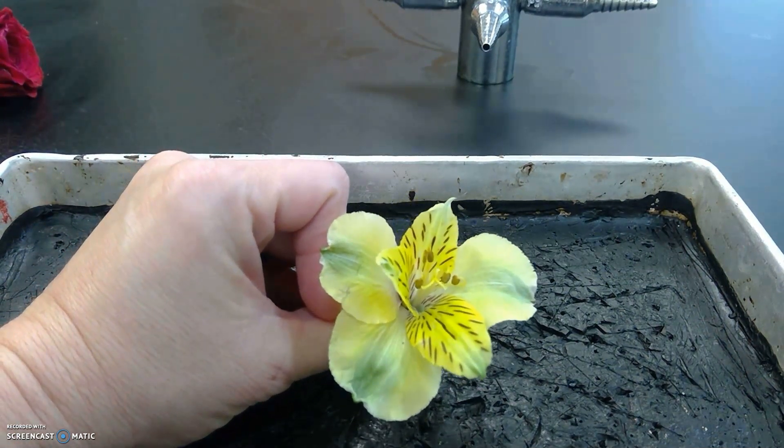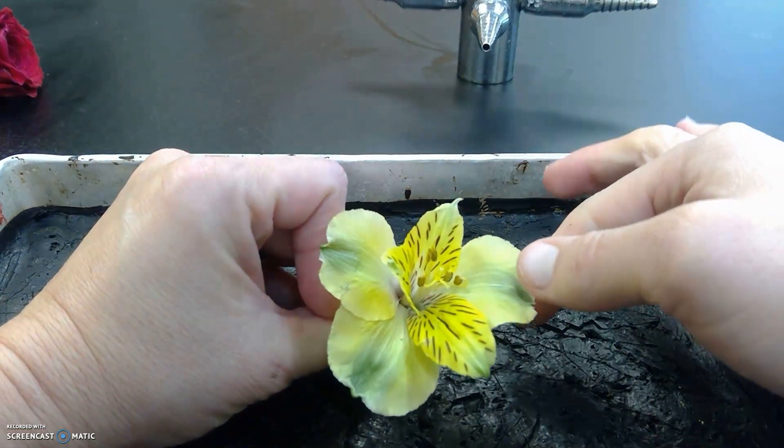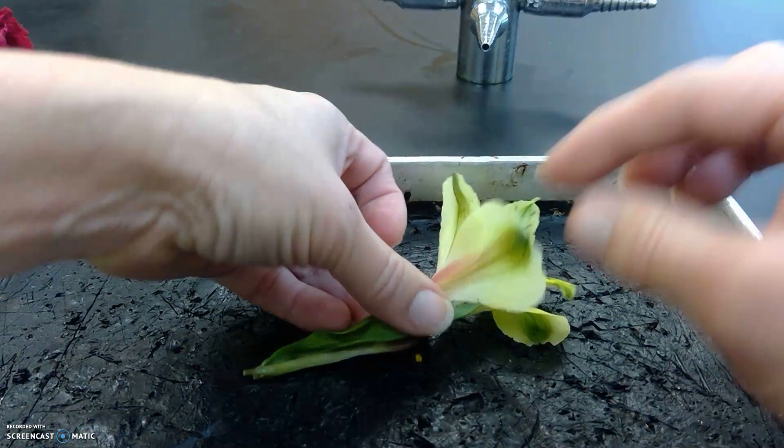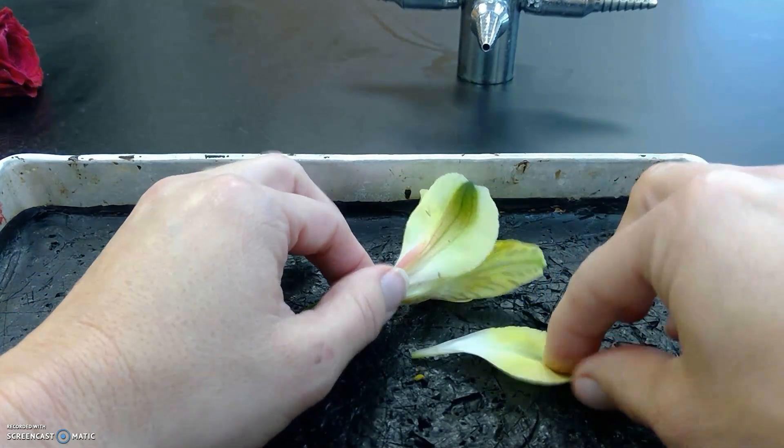It's kind of cool as a flower because its sepals — the job of a sepal is to protect the flower — actually look like they're part of the flower. So if you look at it, these three are sepals. I'm going to take them off.